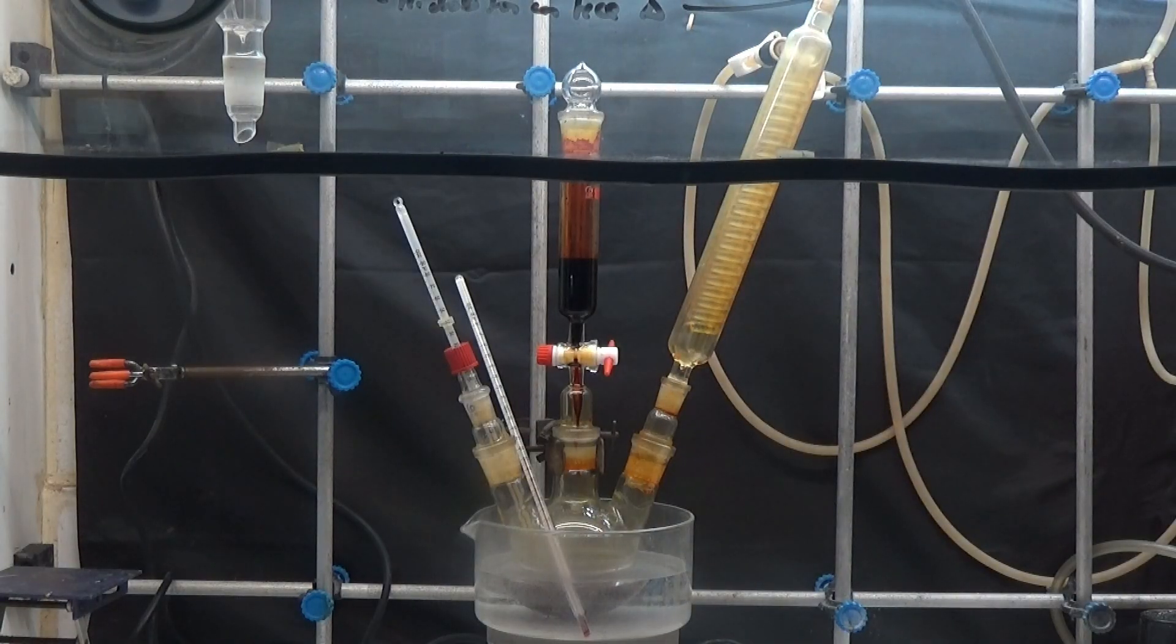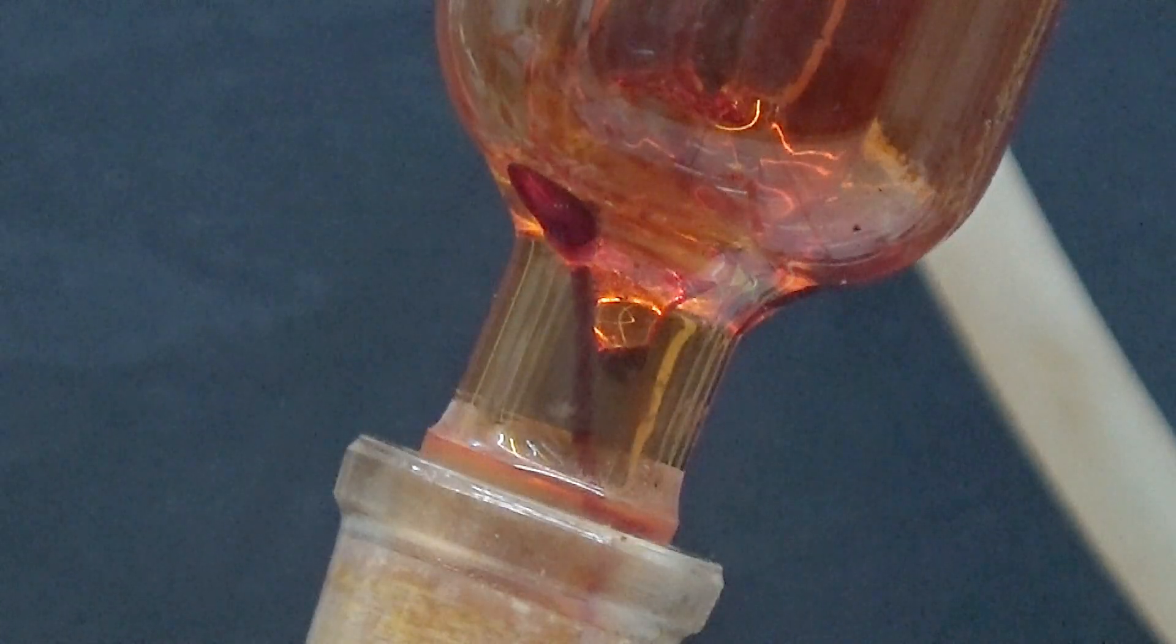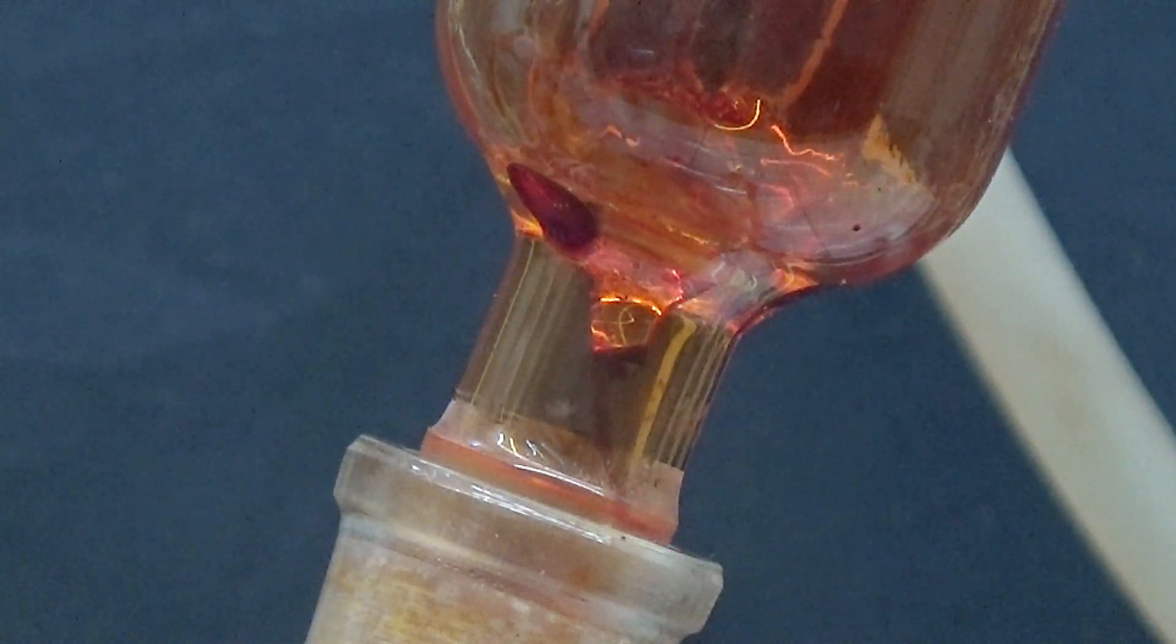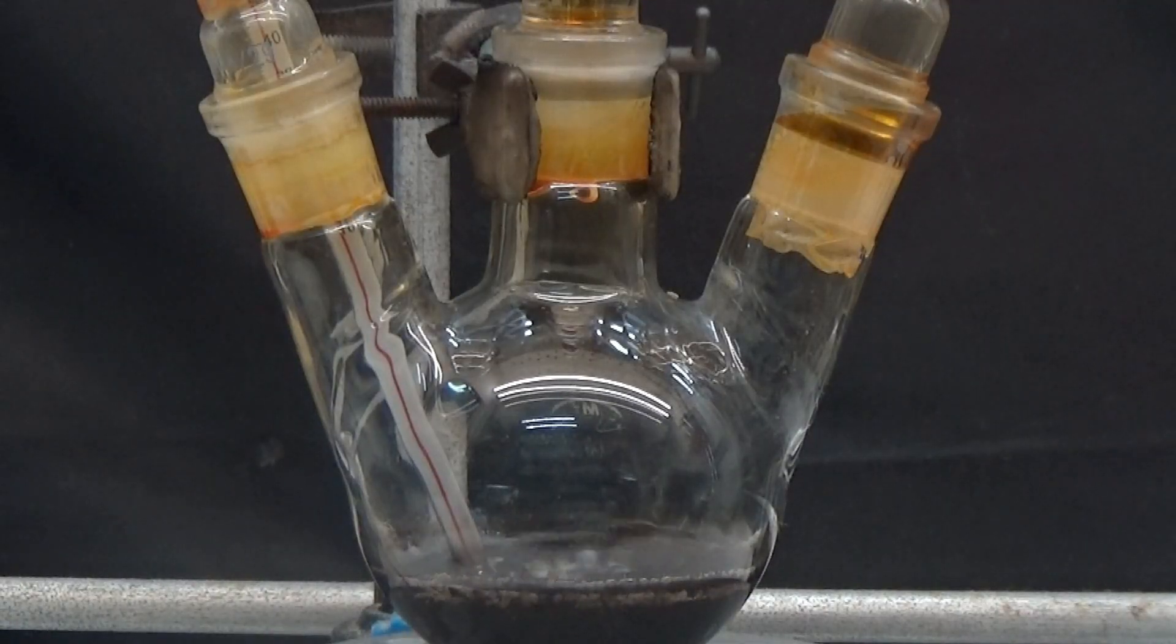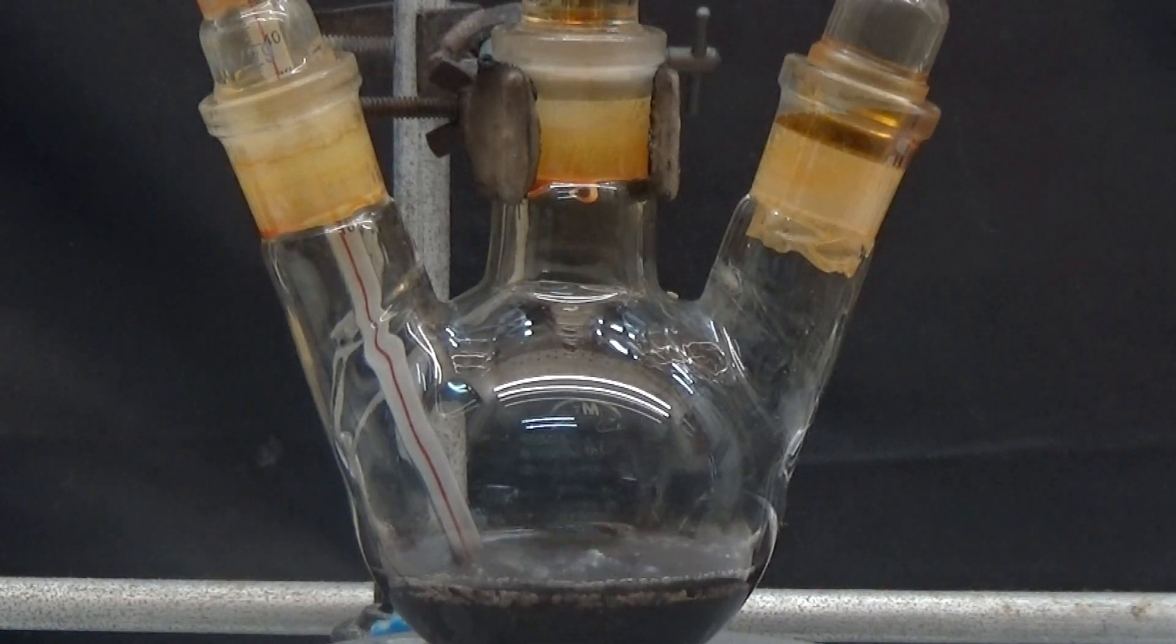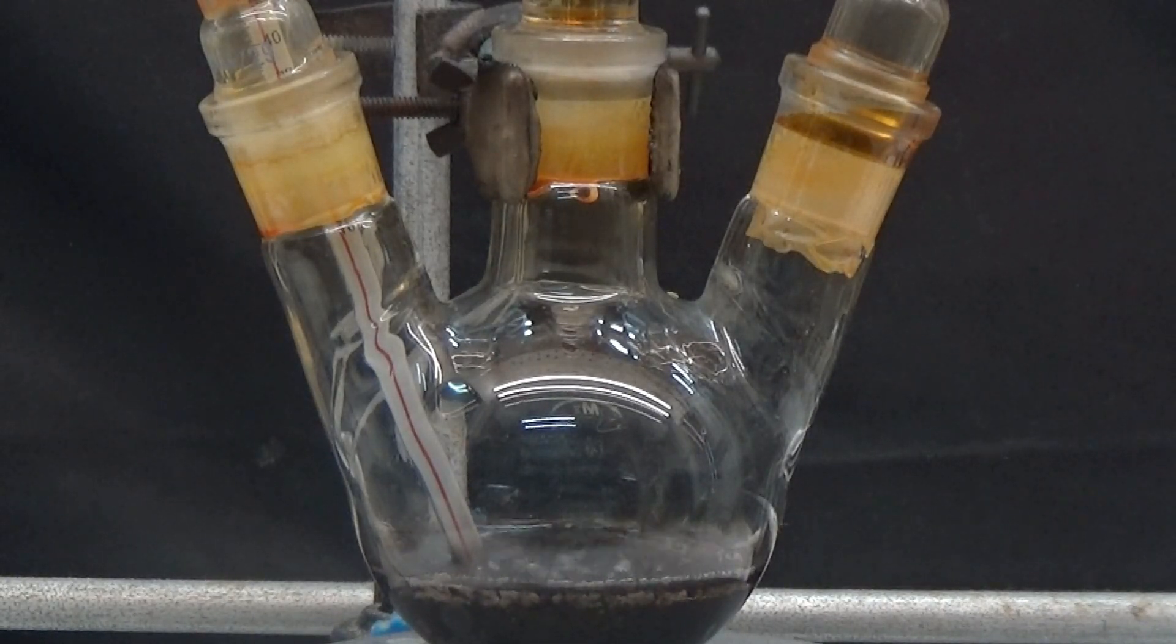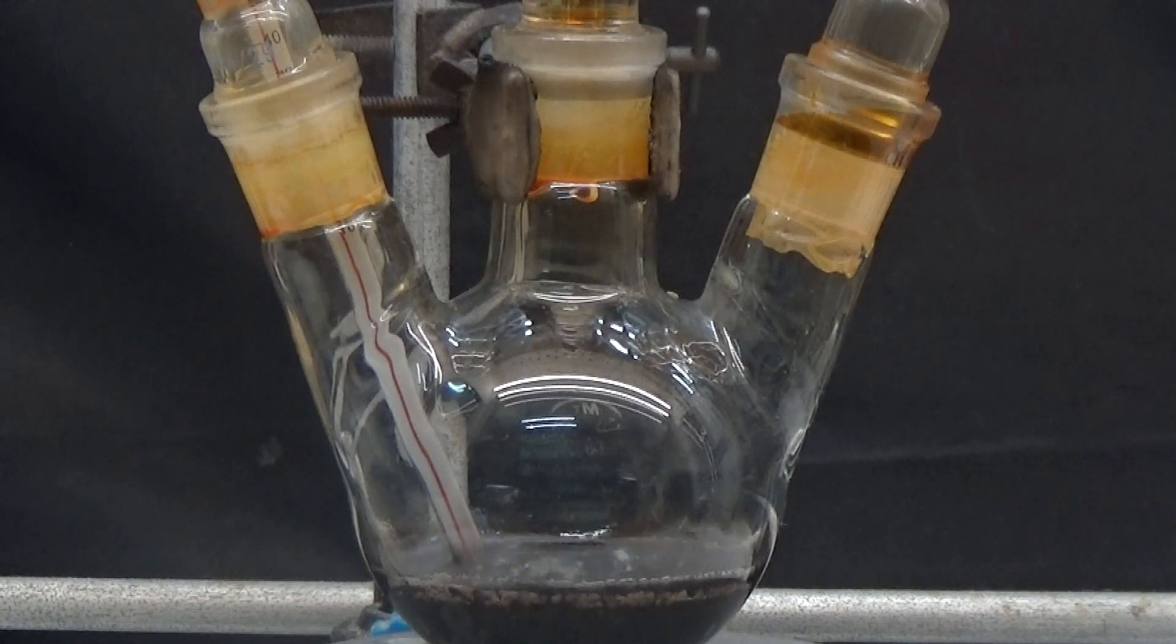Once all the bromine has been added, we heat it gently for two hours. After 30 minutes most of the bromine has disappeared, so we continue heating. After two hours of reflux, the mixture turns black.